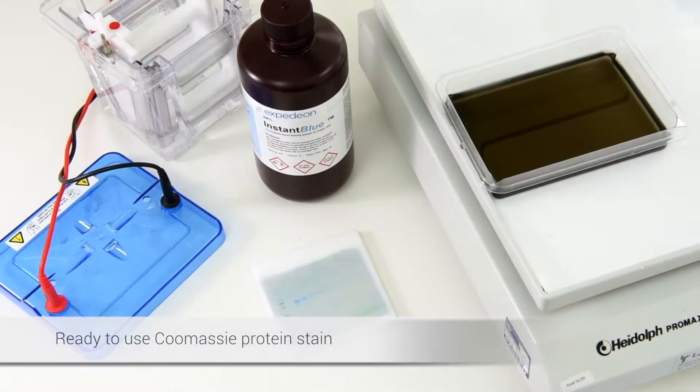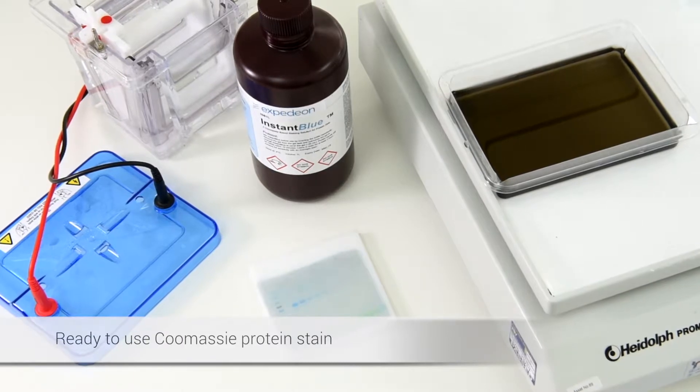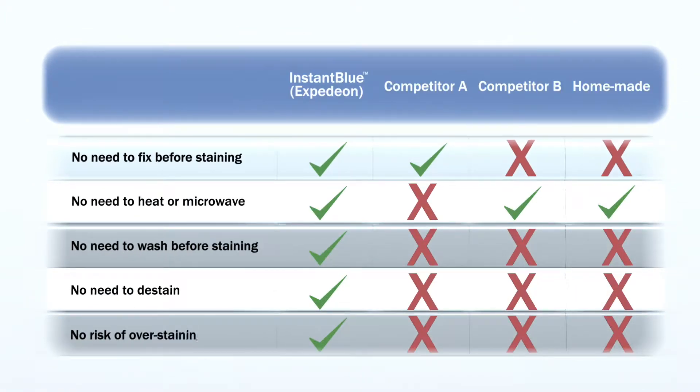InstantBlue is a ready-to-use Coomassie protein stain for polyacrylamide gels. Thanks to its optimized formulation, InstantBlue stains your gel in a single-step incubation without the need for fixing, microwaving, washing, or de-staining.